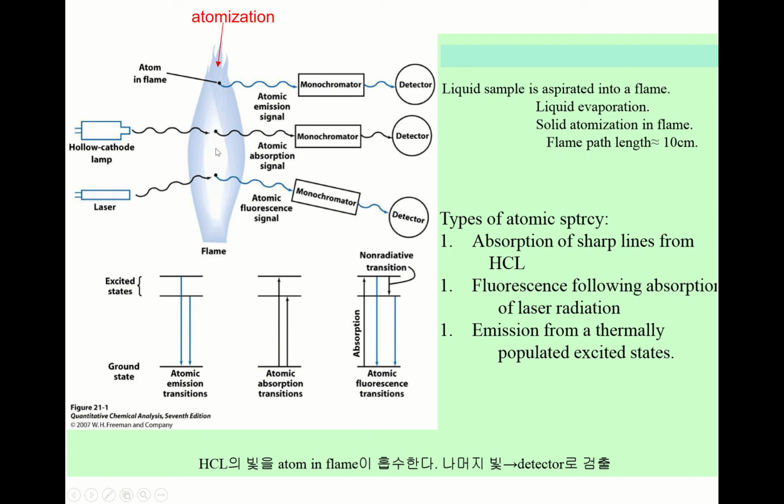Okay, inorganic elements are all destroyed, and yes, we can analyze those inorganic elements. Usually we can analyze the elements. Okay, so atomize the element, metal elements.